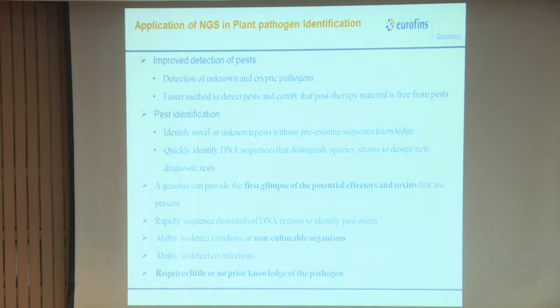So, we also have DNA; we can isolate the DNA from that particular sample and identify which bacterial species it is, whether it is non-culturable. If we do not know which bacteria it is, still we can come to a conclusion that this is getting infected with a non-culturable bacteria which cannot be cultured. So, we can do a DNA sequencing and identify that, right.